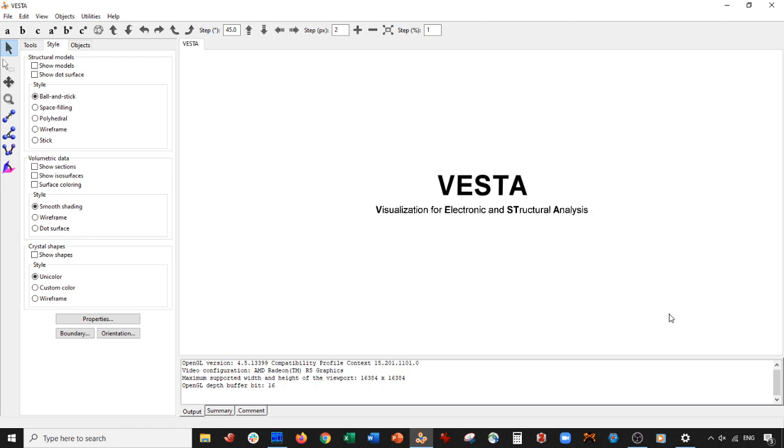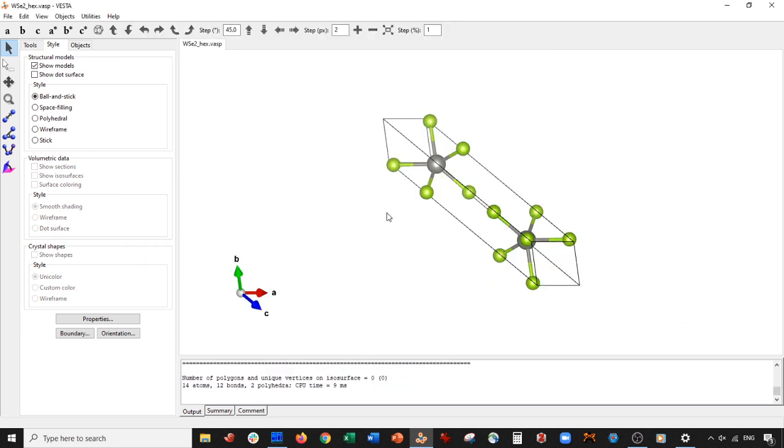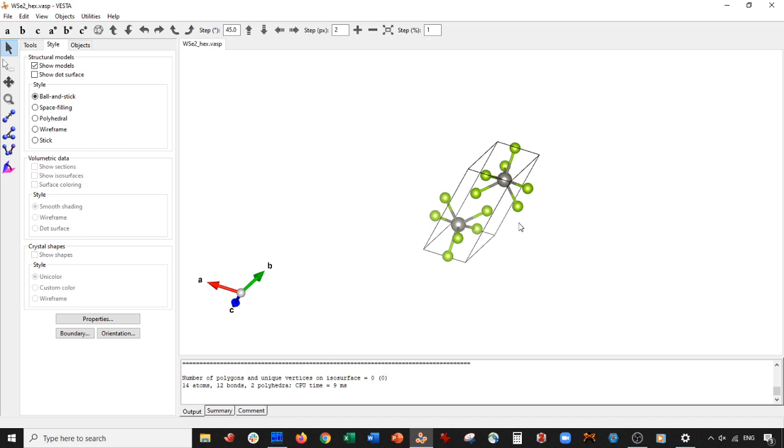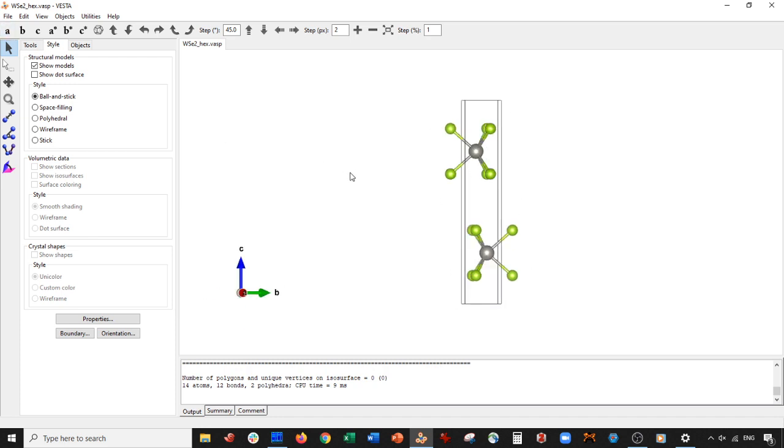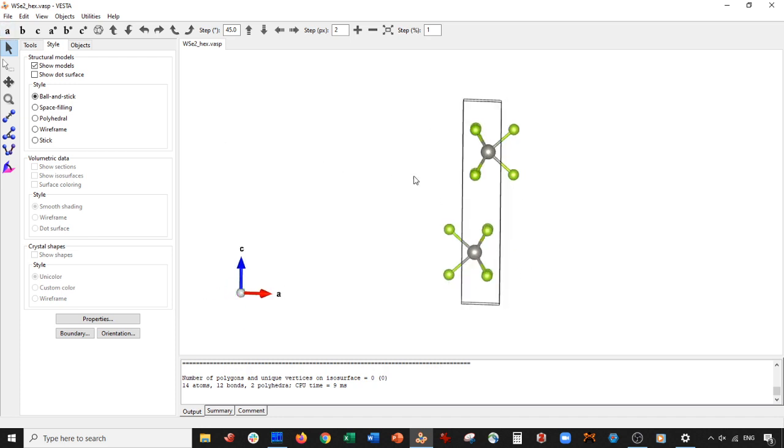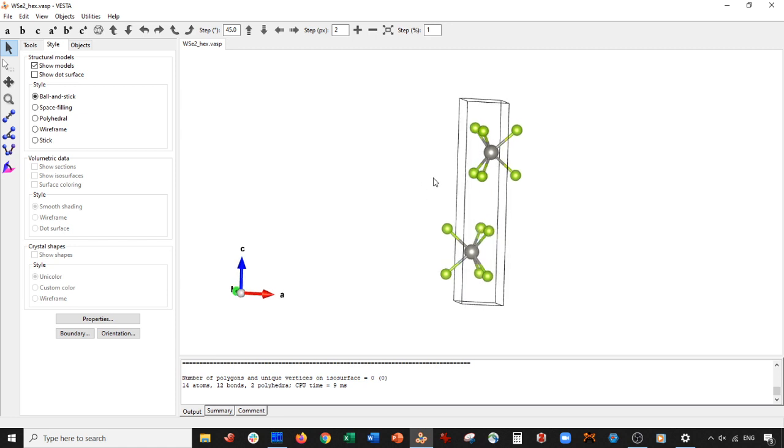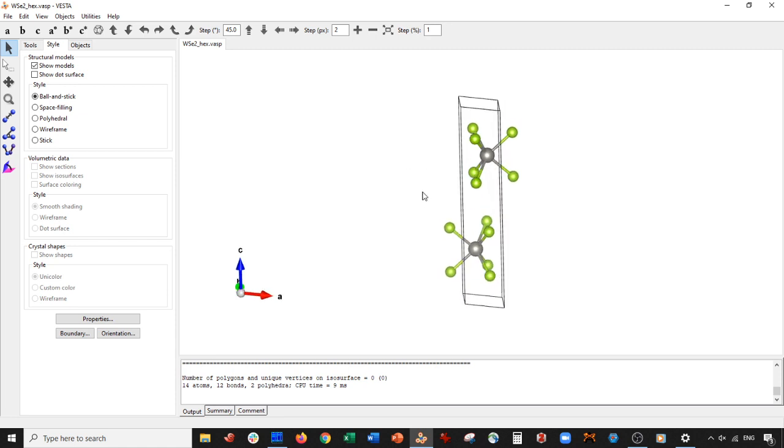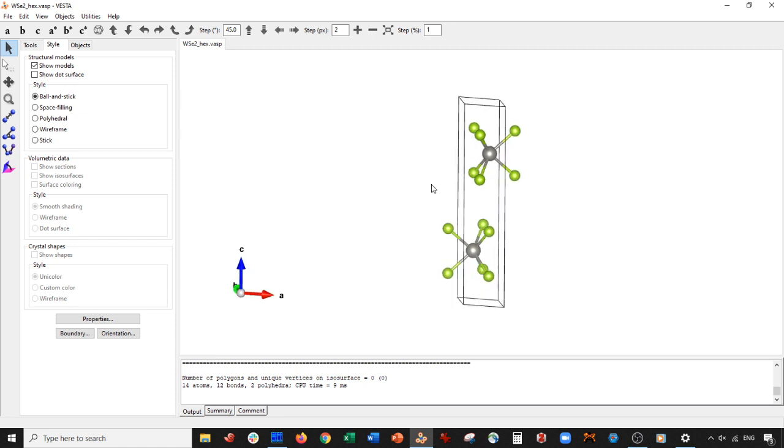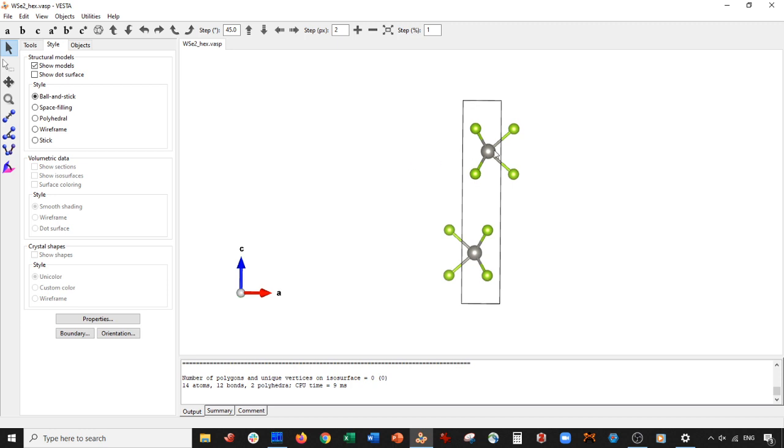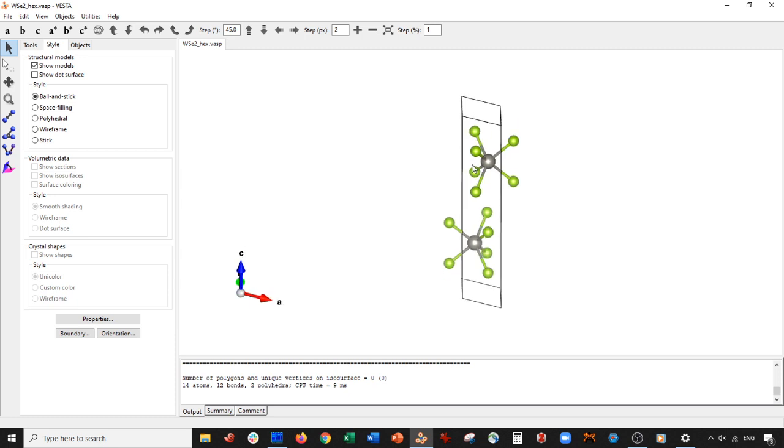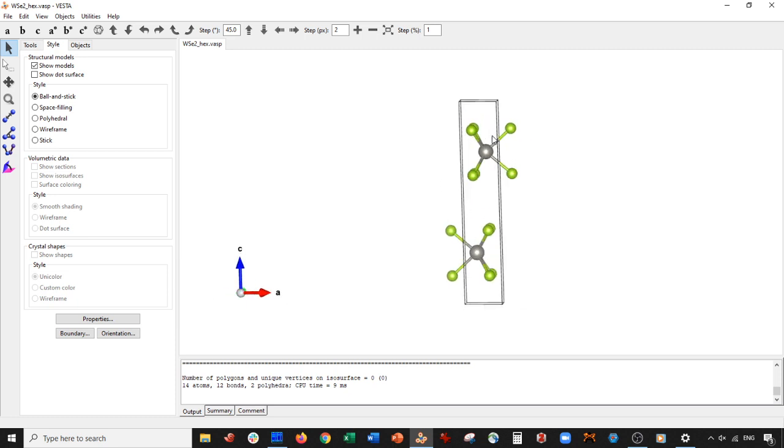So let's go ahead and open up our unit cell of tungsten selenide, which is hexagonal. You might get something like this from your CIF file or something. And basically the monolayer could be two things: it could be this entire thing here, or it could just be basically this top part.